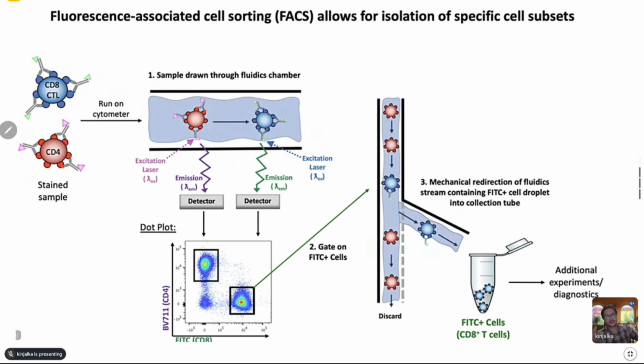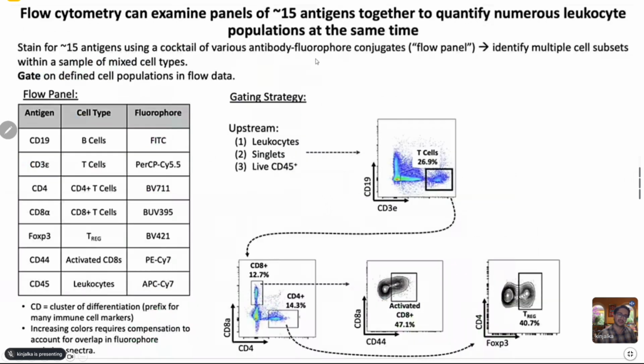So what happens is, suppose you have a mixture and you want to look for mutations. The numbers or intensity of those mutations, if they are few, are going to go down because you're amplifying everything, the signal and the noise. With this kind of sorting, you're increasing the signal or your cell of interest, after which you can work on those cells, look at their genetic makeup, look at the kind of metabolites they are releasing, the proteins they are releasing, and so on. So FACS or fluorescence associated cell sorting is one of those things which are used.